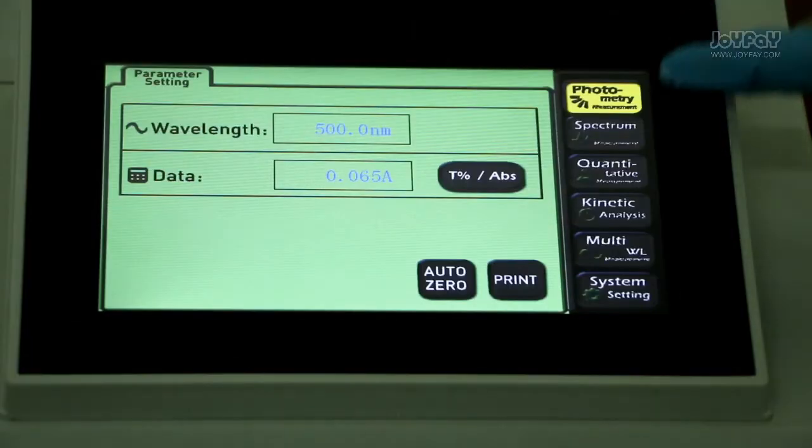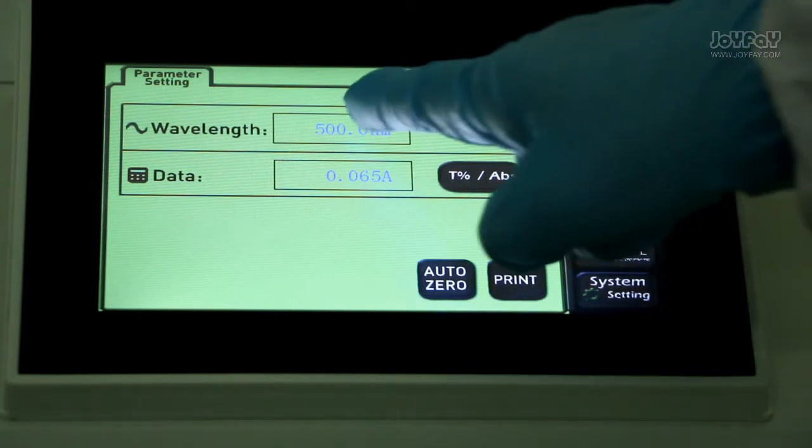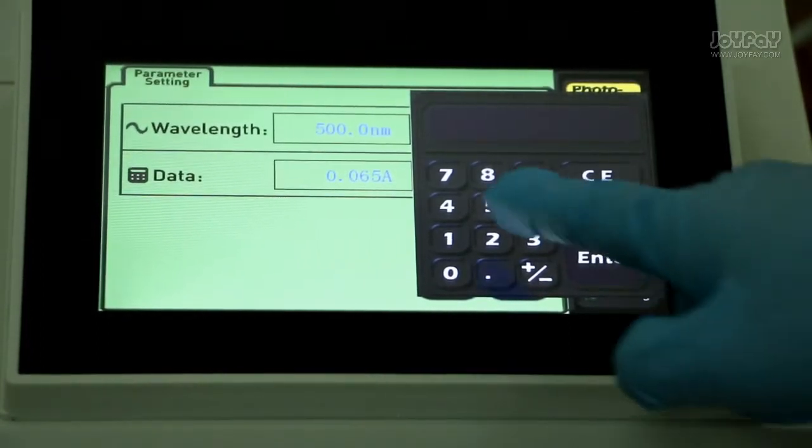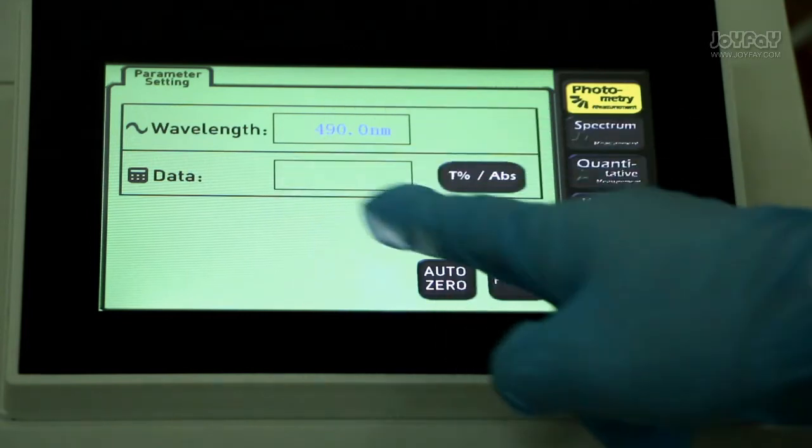Testing lamp. First measurement is photometry measurement, which is the easiest one. Press the blank box beside wavelengths. There is a keyboard popping out. Enter the wavelengths you know, and then you can see the data.